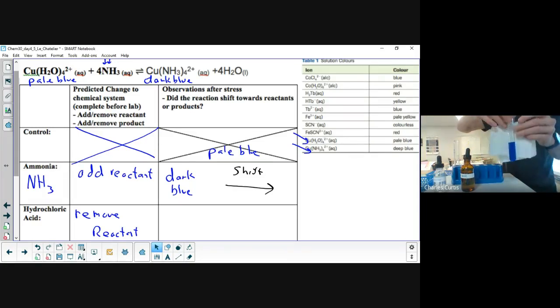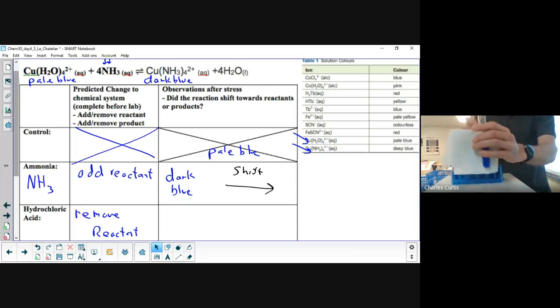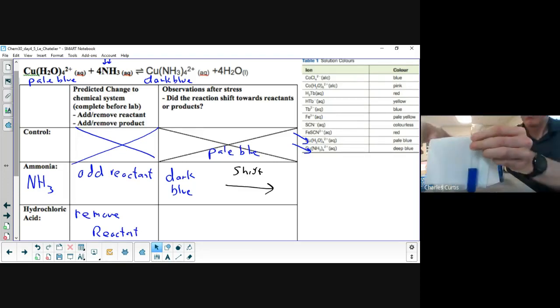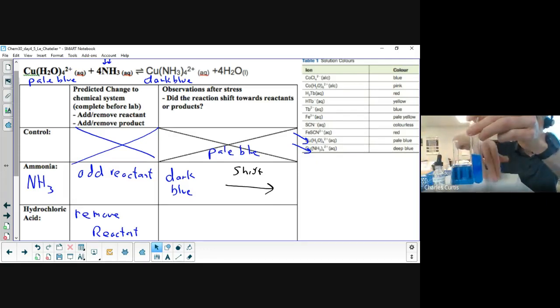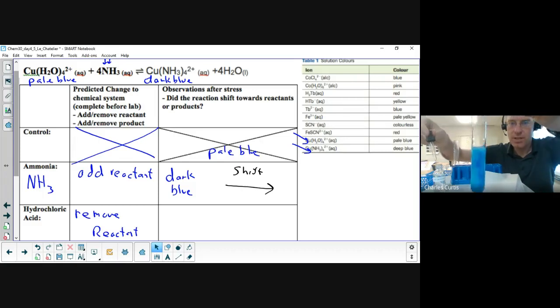Let's see what happens when I add hydrochloric acid to this. We're expecting it to remove that ammonia. Looks like it got a little lighter on top for a second. Let's set the paper towel. Now I added a lot of ammonia, so it's going to take a bit of acid to see our shift. And yeah, the dark blue is fading. And we're back to that light blue.